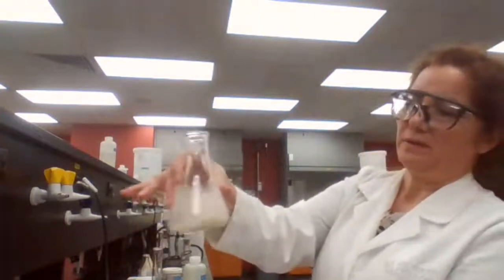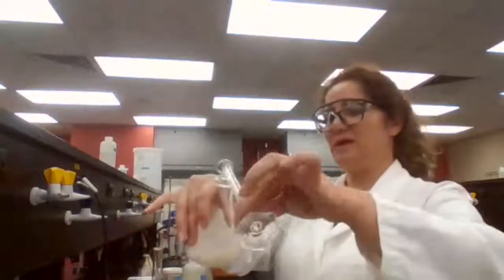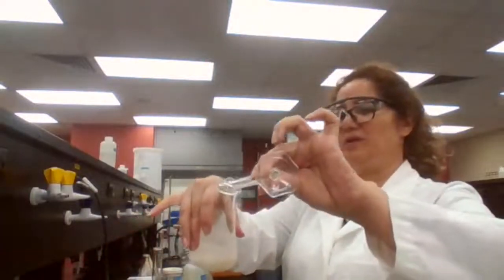See the white powder is forming? That is the product, acetanilide, that is forming.